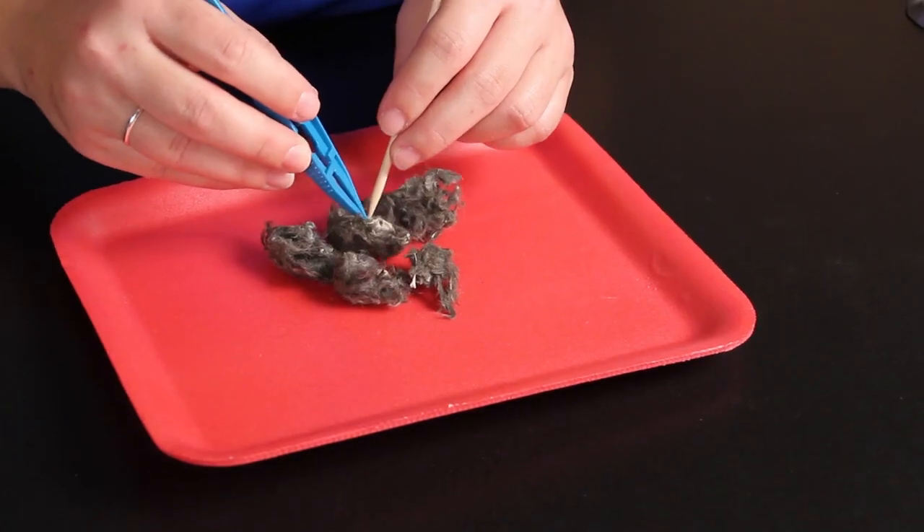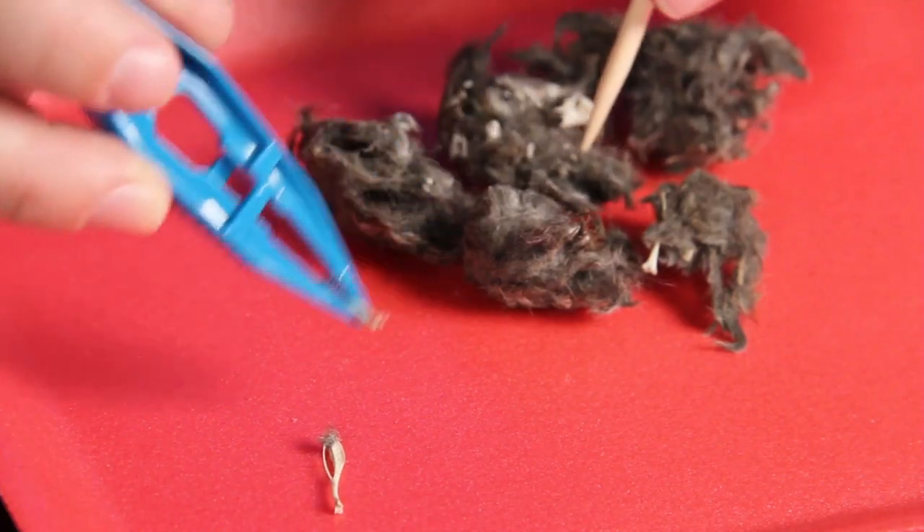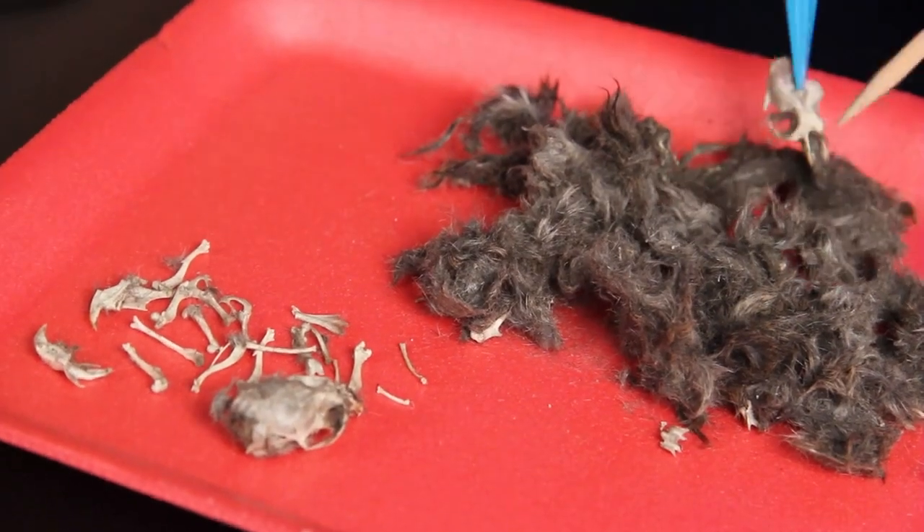Using the wooden probes and dissecting forceps, carefully separate the bones from the fur. The bones are brittle, so go slowly to avoid any breakage.